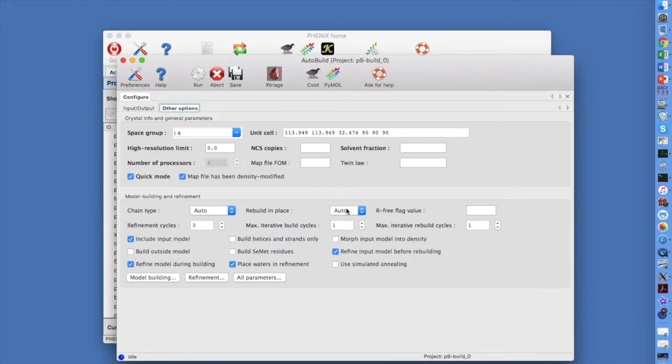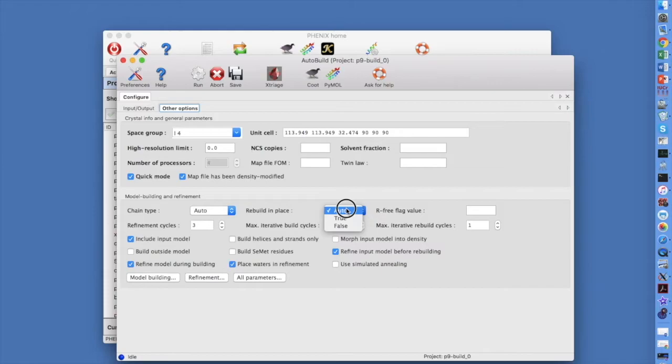We will also leave Rebuild in Place set to Auto. If we had supplied a model, then we could set Rebuild in Place to True if we wanted to keep the connectivity or False if we wanted to rebuild it completely.